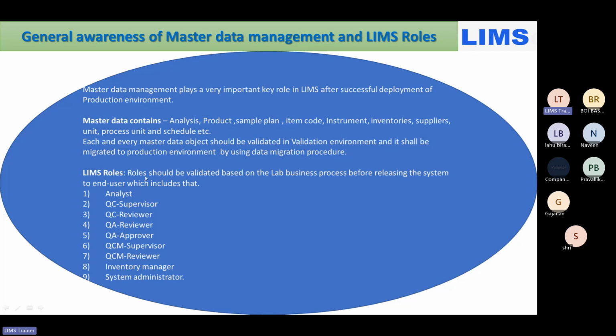Now the LIMS roles, the different roles of the working persons with the software. See, the analyst, or we can say end user, then the supervisor, reviewer 1, 2, approver, then the manager, supervisor, the lab reviewer, inventory manager. The system administrator handles all the login credentials. Any requirement related to the credentials will be handled by the administrator.